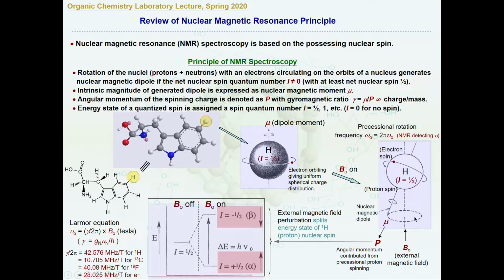You can see this magnetic field does respond to the external magnetic field, because the NMR machine does consist of a big magnet, a megahertz magnet in there. So when you turn it on, even though this is a very tiny magnet, it will respond to the external magnetic field and align around it, right? And once they align around it, it will not be standing perpendicular to the direction, the vector of the external magnetic field.